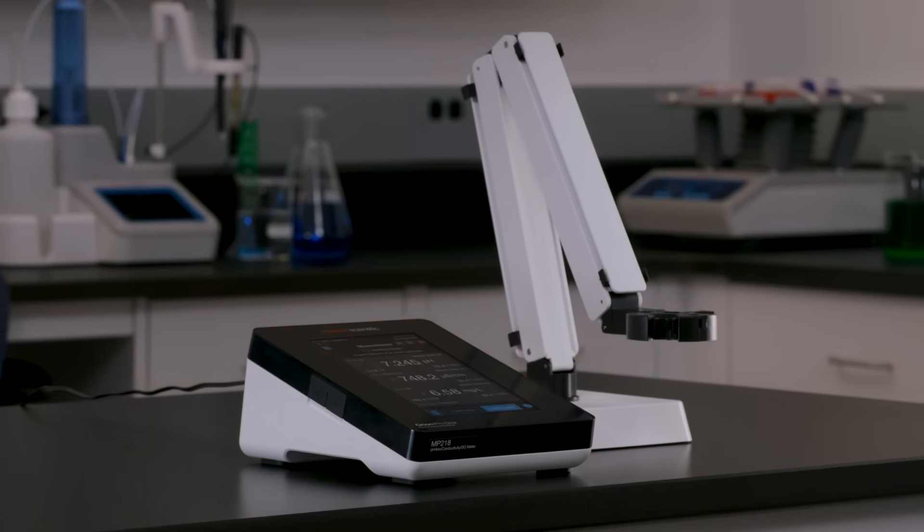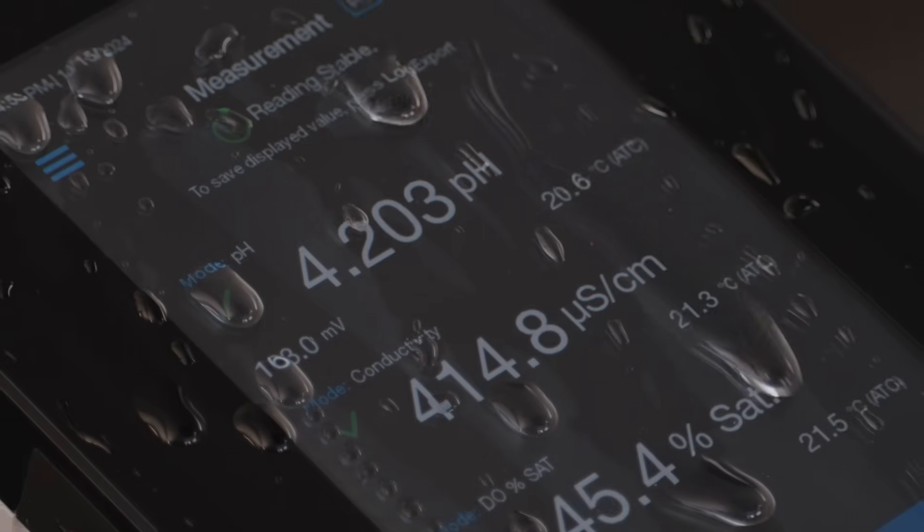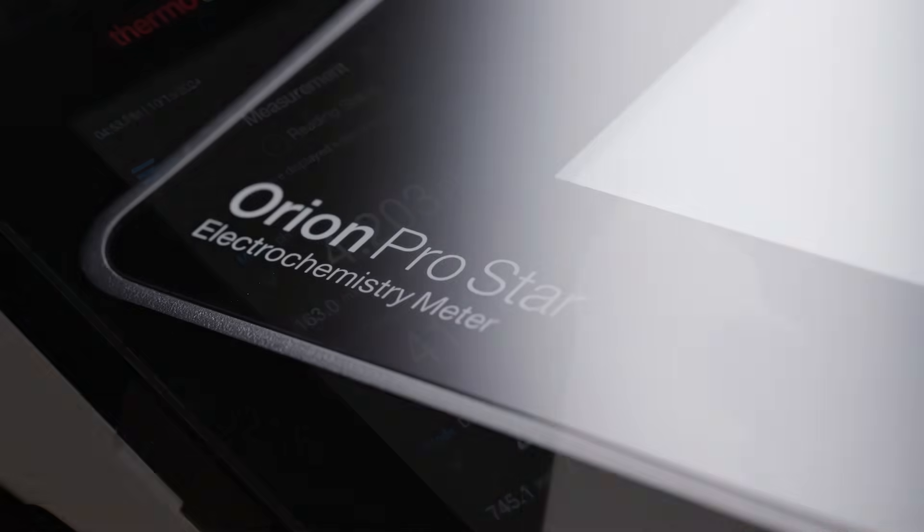Best of all, the Orion ProStar is backed by an IP54 rating, making it splash and dust resistant to help ensure uninterrupted operation even in the most challenging environments.